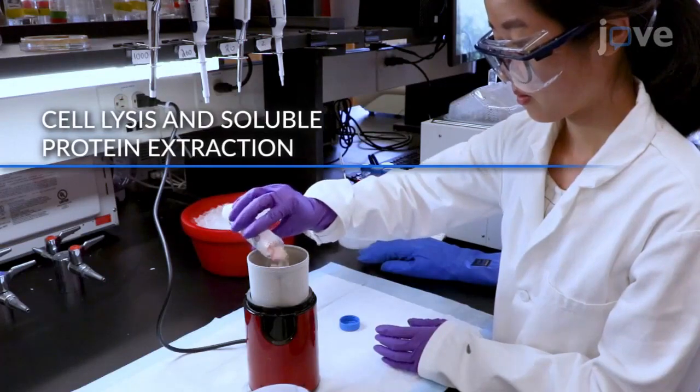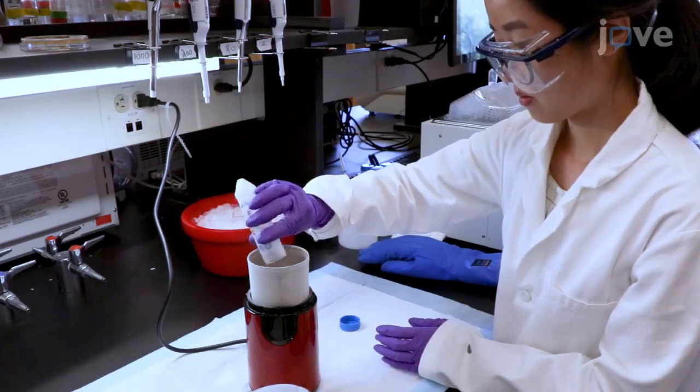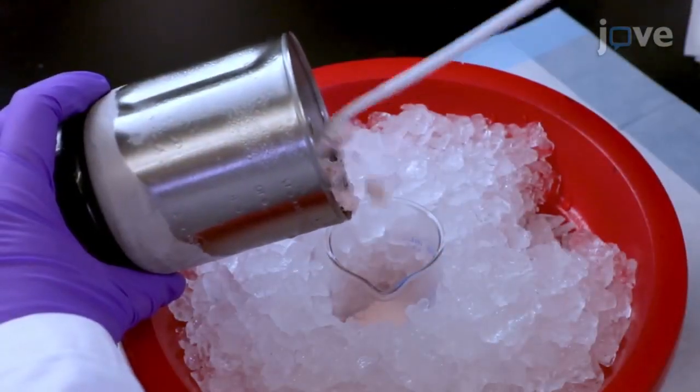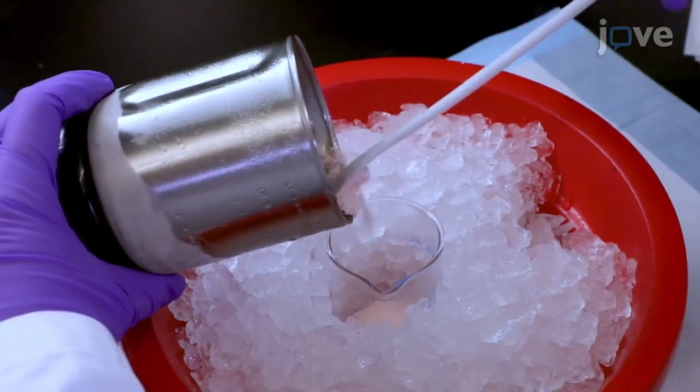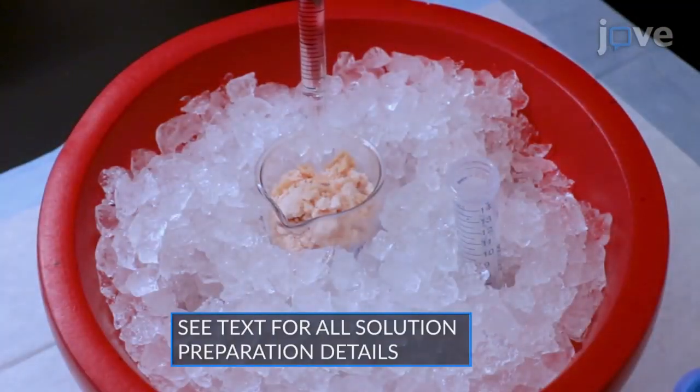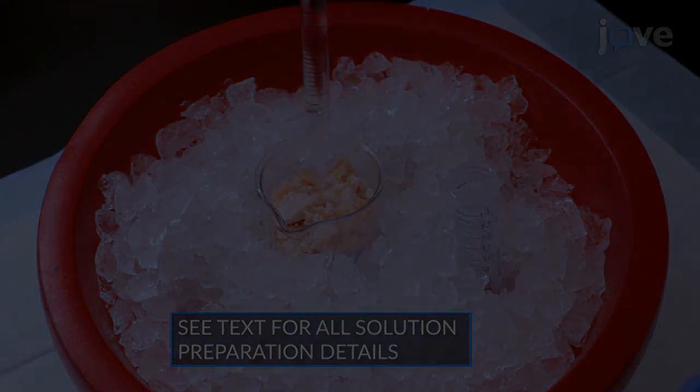For motor protein purification, use a blade type coffee grinder pre-chilled with liquid nitrogen to grind the frozen yeast pellets into a fine powder and transfer the yeast powder into a pre-chilled 100 milliliter glass beaker on ice. Add a small volume of freshly prepared lysis buffer with supplements to the powder.